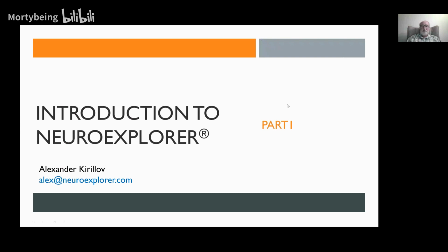So let's go over this. This is NeuroExplorer. I started working on it maybe in 1996, and the first release was in 1998. So it will be 25 years next year.